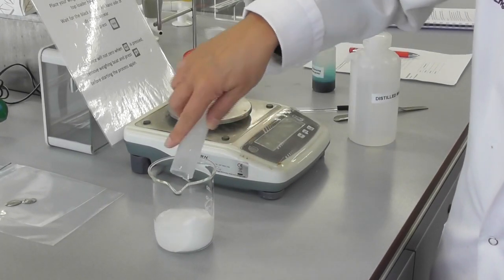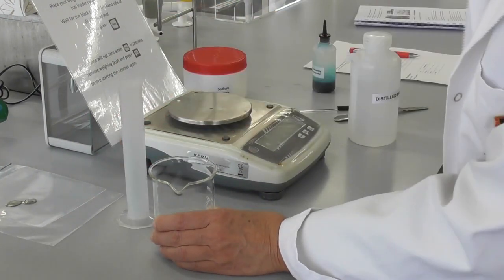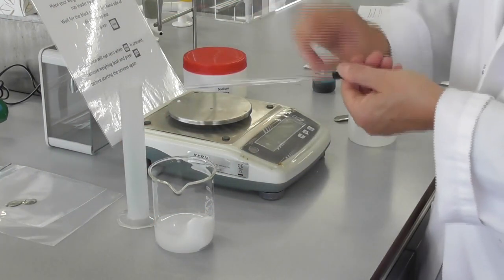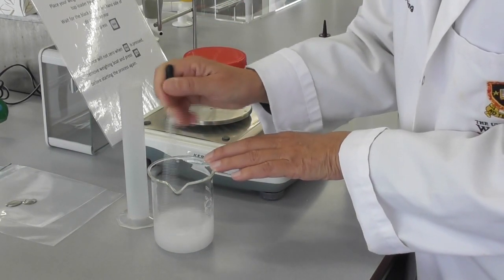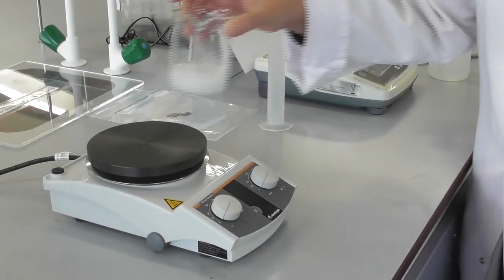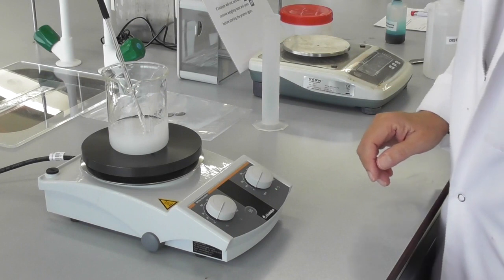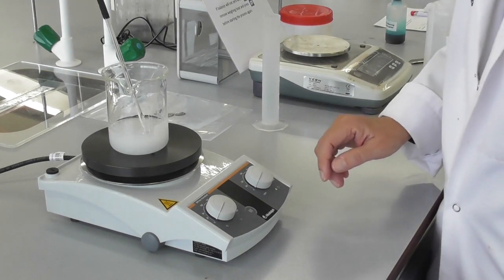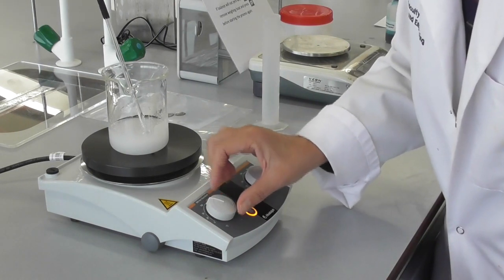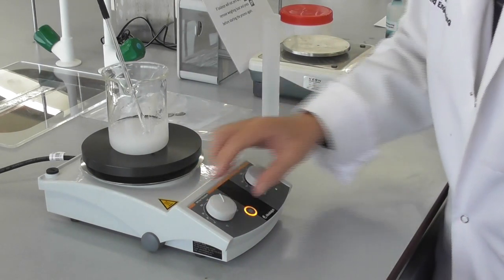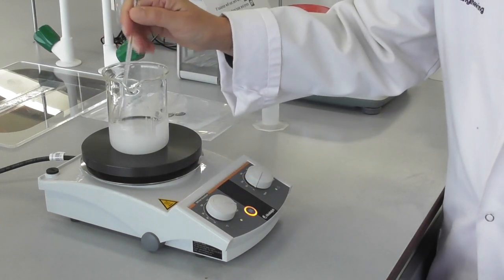We add the water to the sodium acetate in the beaker and stir the mixture. We put the beaker with the mixture on top of a hot plate and turn the heat up and gently stir the mixture.